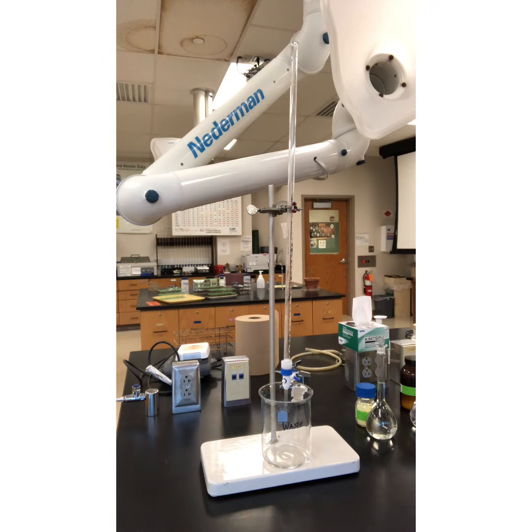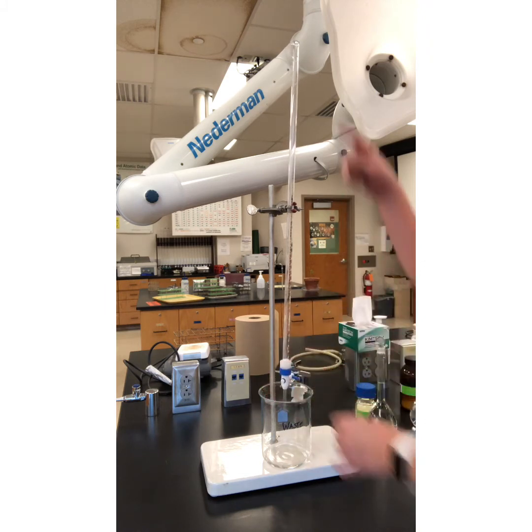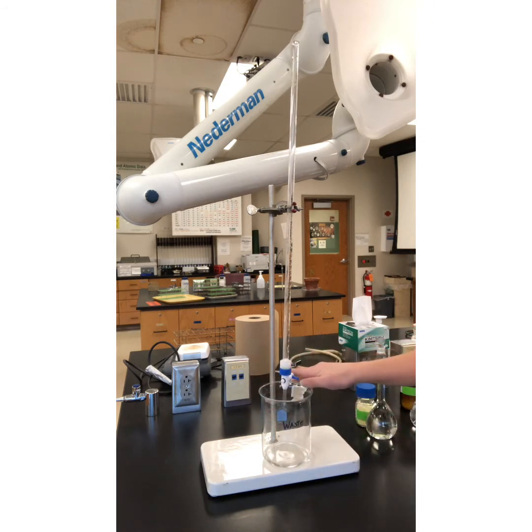So this one is marked where this volume up here is 0 milliliters, and then our volume down to 50 milliliters at the bottom. So down here we have a stopcock that opens and closes to allow your solution, your titrant, to go through the burette. So we're going to do the titrant and create a change in color in our solution. When the stopcock here, if you can see it, it's a little bit on the back, is perpendicular to the burette, it is closed.